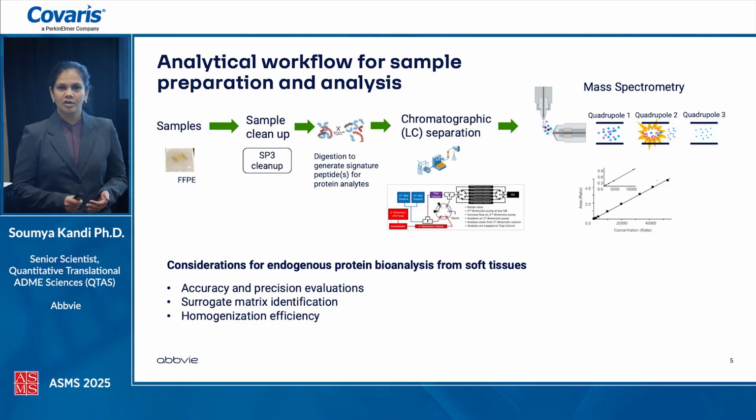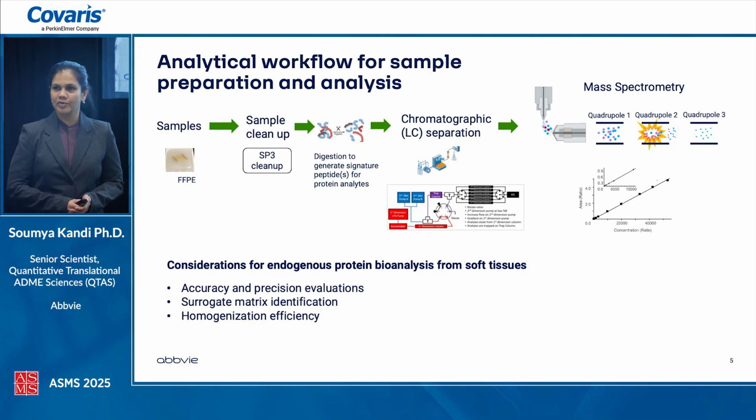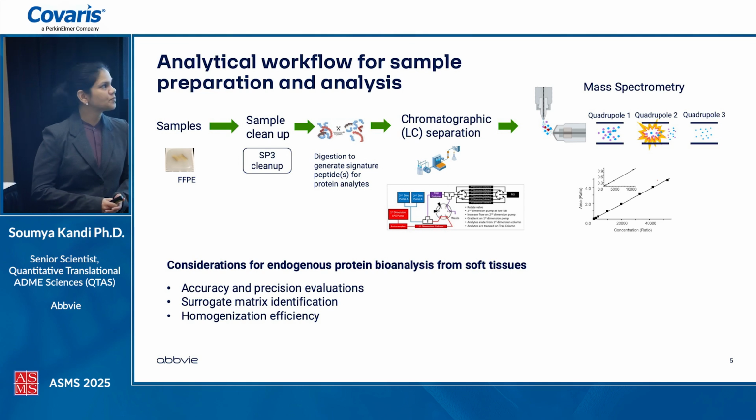On the chromatographic separation side, we have a one-dimensional liquid chromatography system. So we have high-pressure liquid chromatography. And then we also have a 2D HPLC system that is set up. So these are heart-cut methods that we typically use for enrichment online.